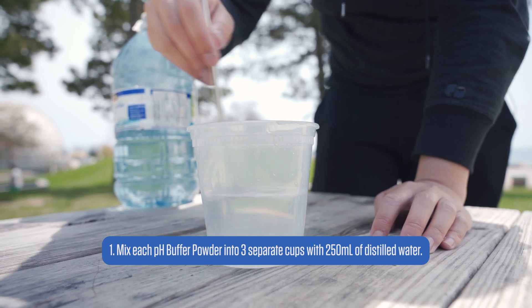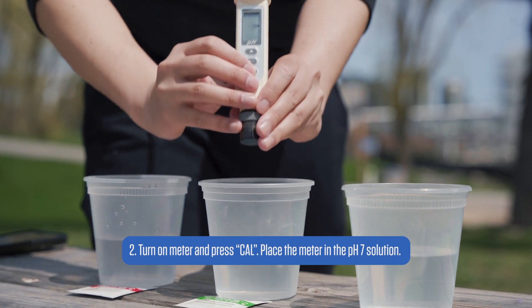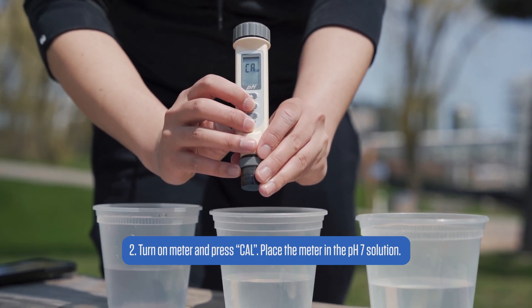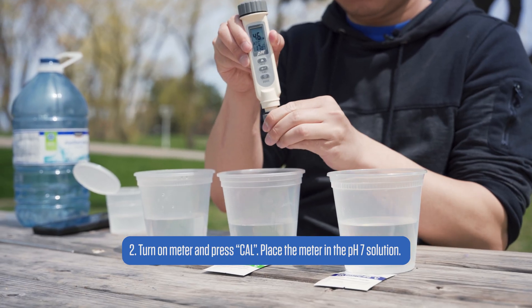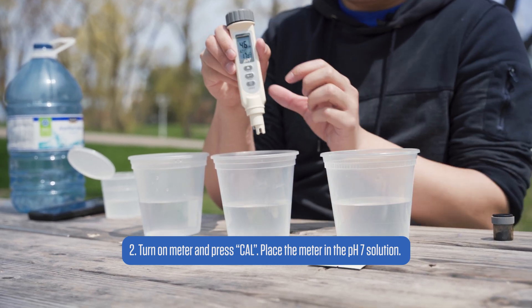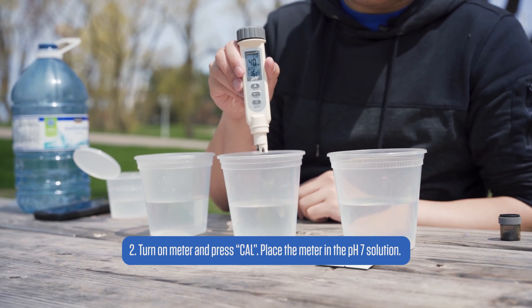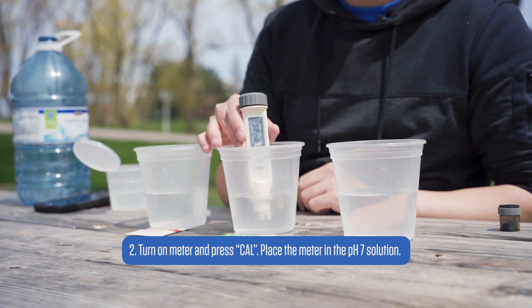Now that the three solutions are prepared in front of us, we will power on the meter and press CAL. The letters CAL will also appear on the screen for one second before flashing 4, 7, or 10. We will always start with the pH of 7 for calibrations and then 4 or 10 for better accuracy. Now just dip the meter into the solution and wait. The meter will recognize the solution's pH and indicate it on the screen — in this case, 7.